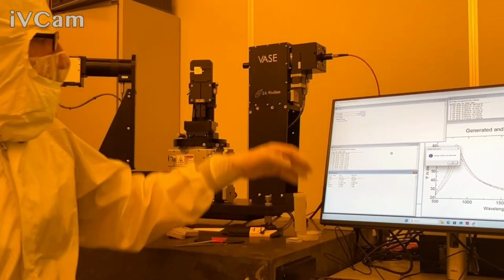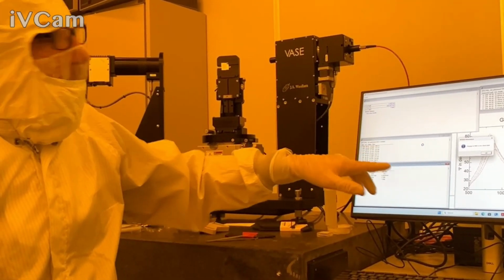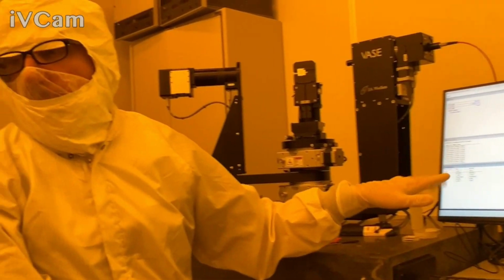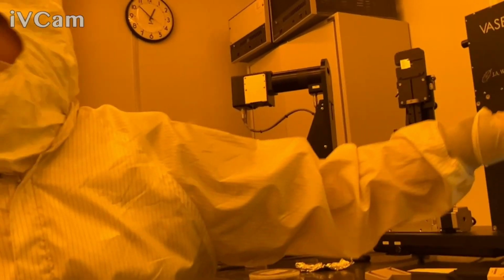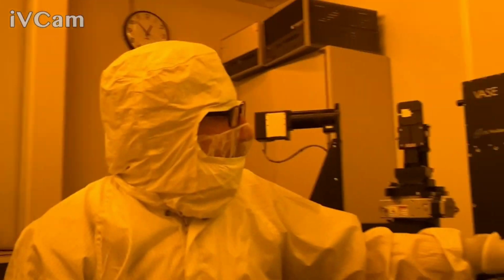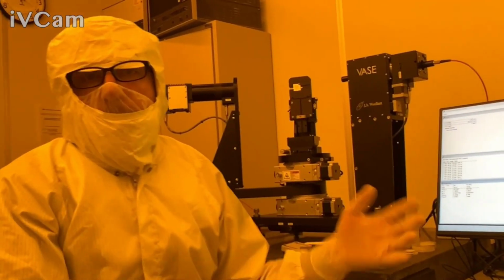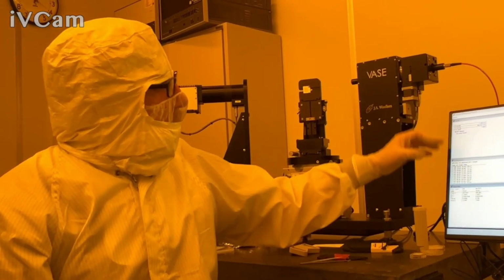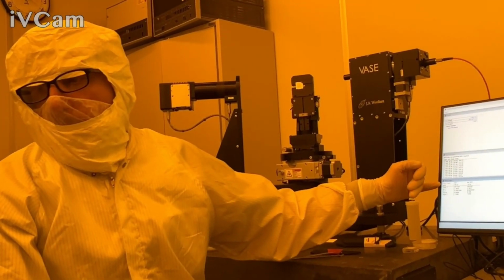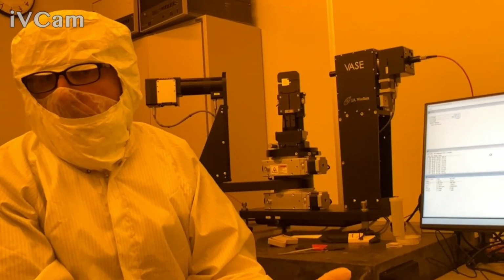In this case, it wanted a little bit of roughness, but I didn't show this a little bit ago, we were hovering without roughness with an MSE, or a fit quality, around 20 for this particular model. So in this case, it kept a little bit of roughness, but the MSE stayed very, very similar. From our standpoint, it would not be justified to leave the roughness in this case. We want a large improvement in this MSE parameter, the mean squared error, to justify the extra optical parameter.